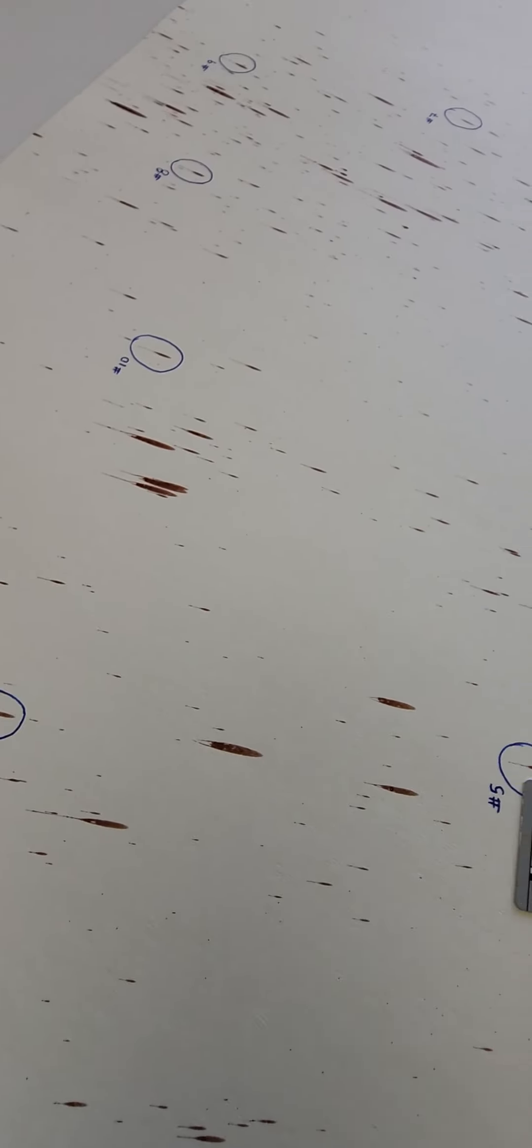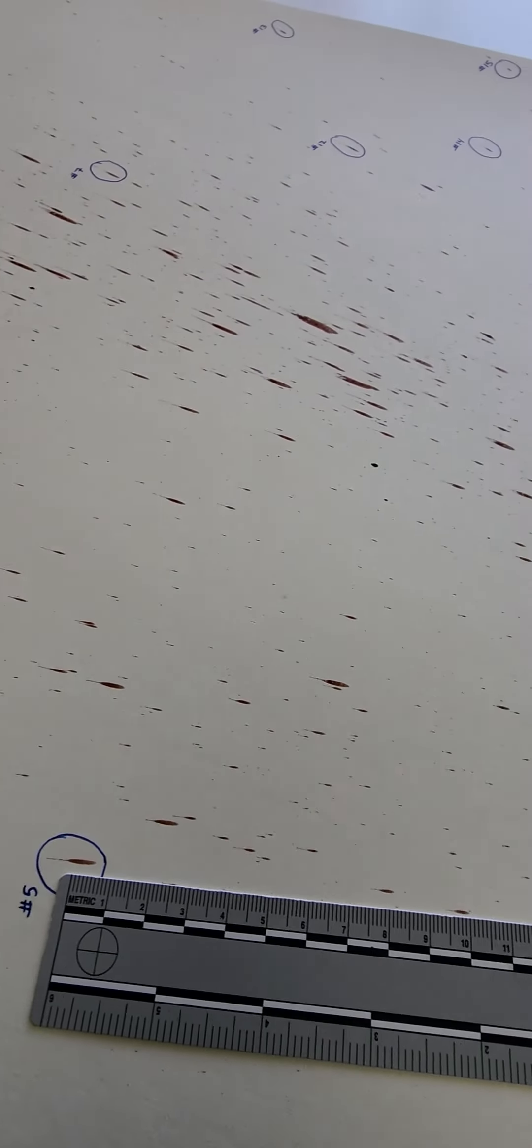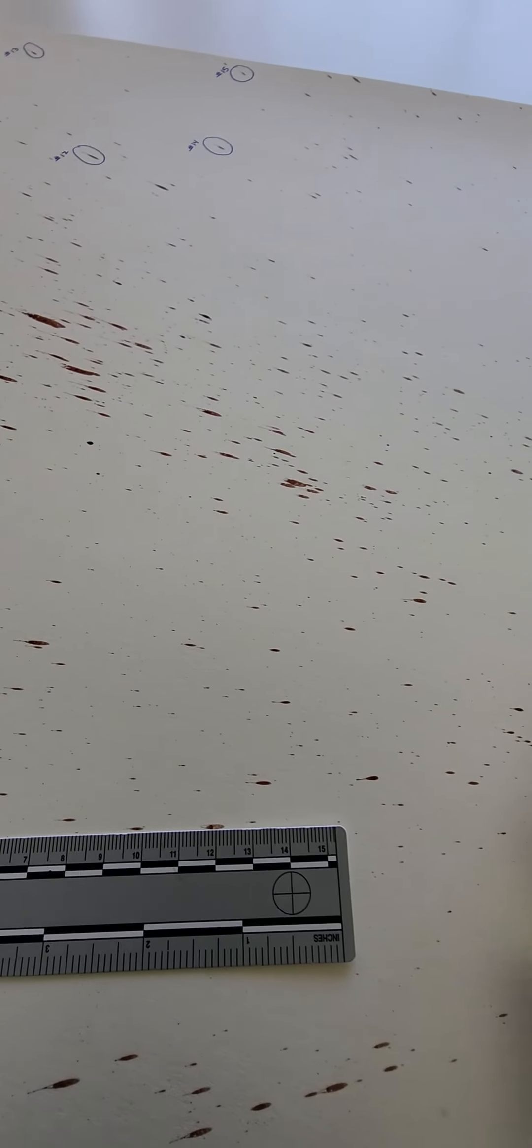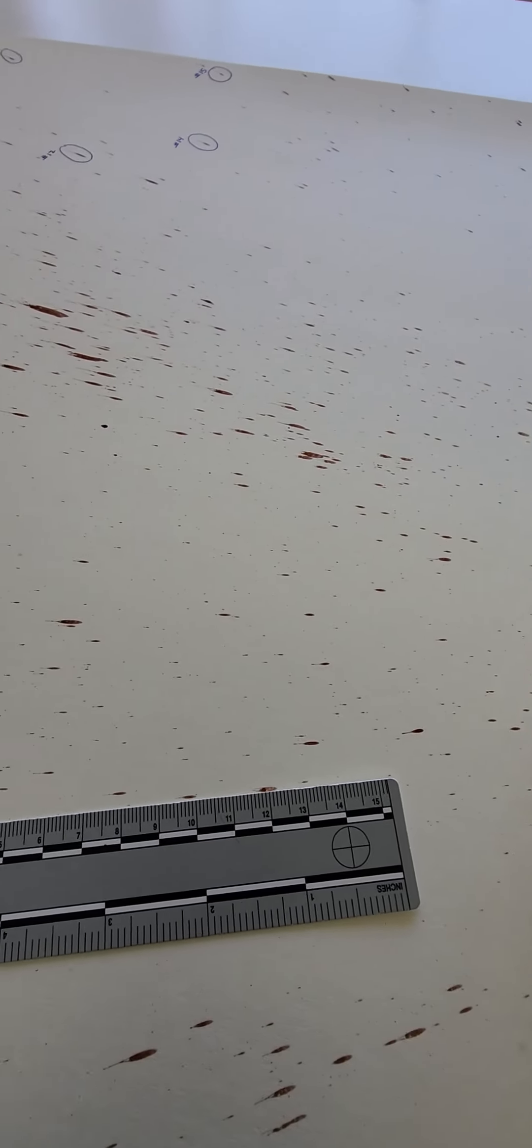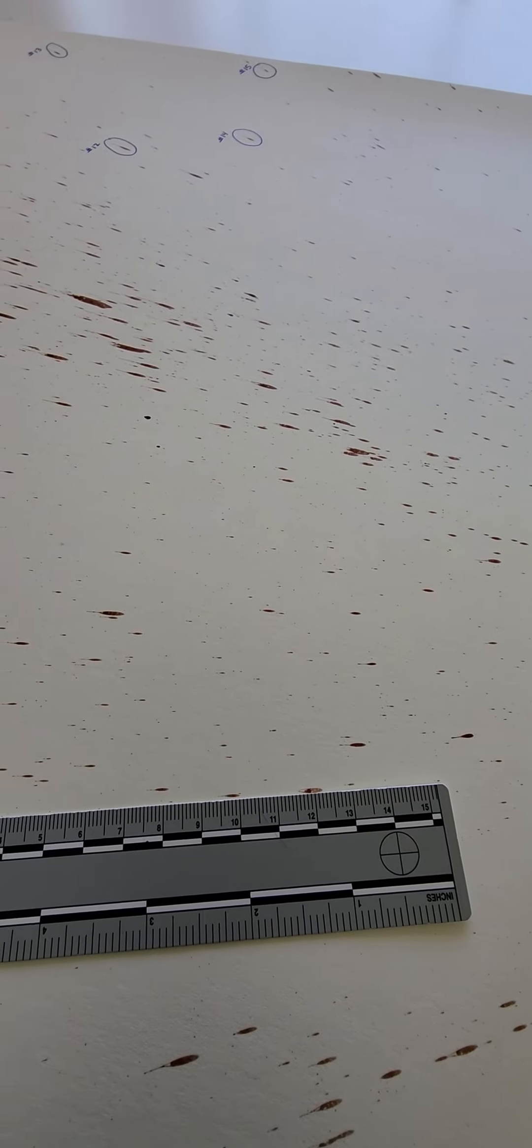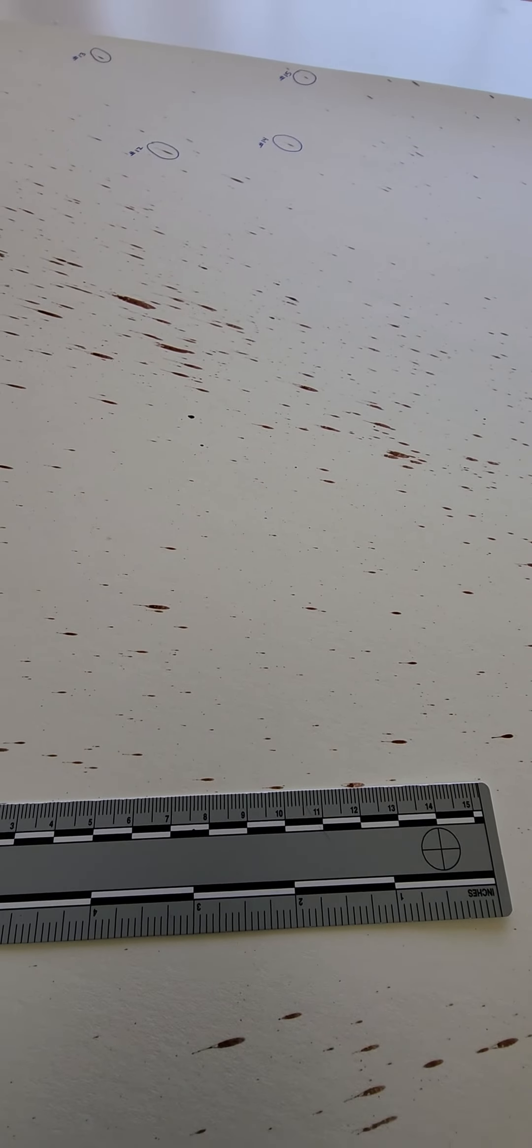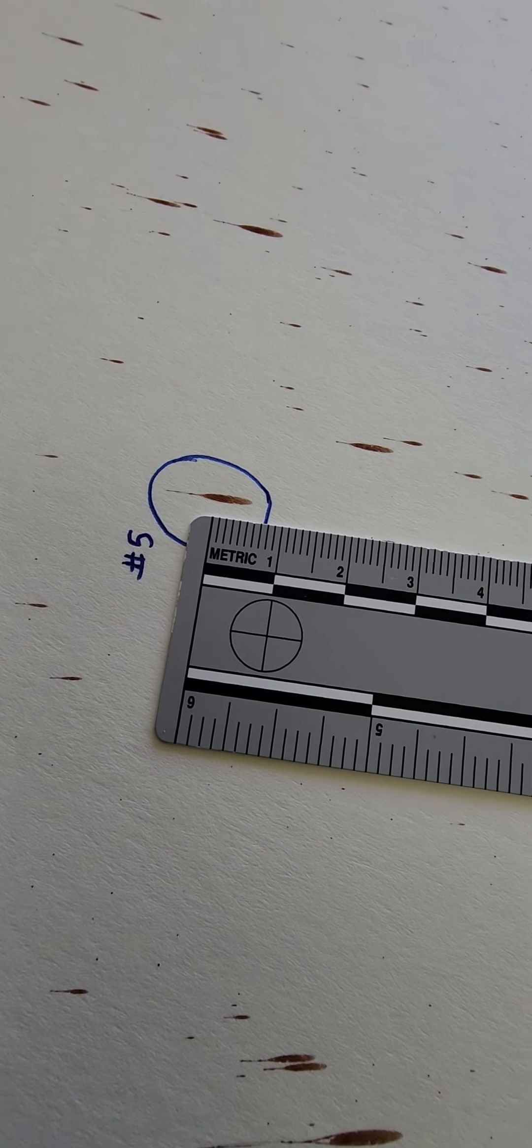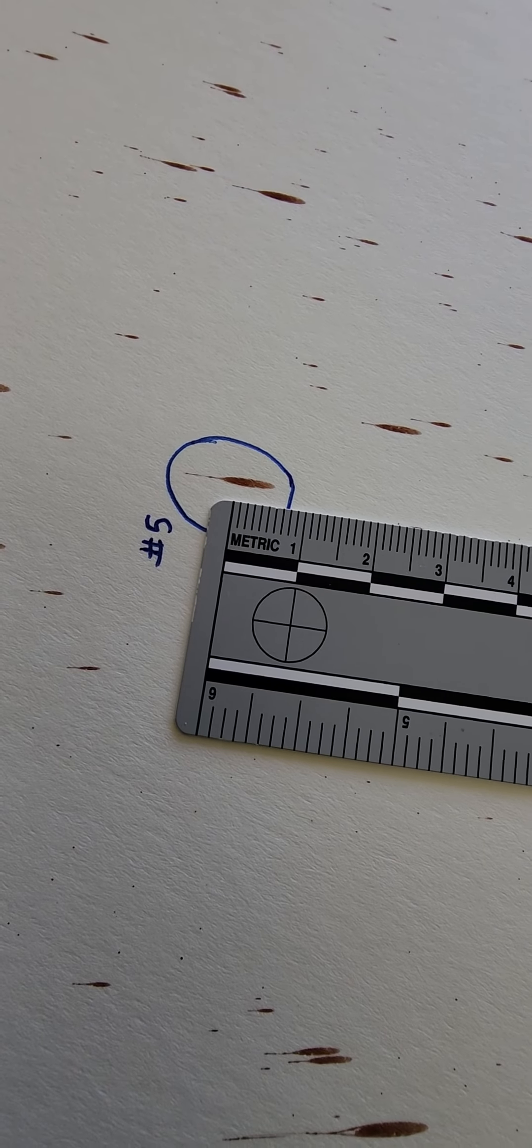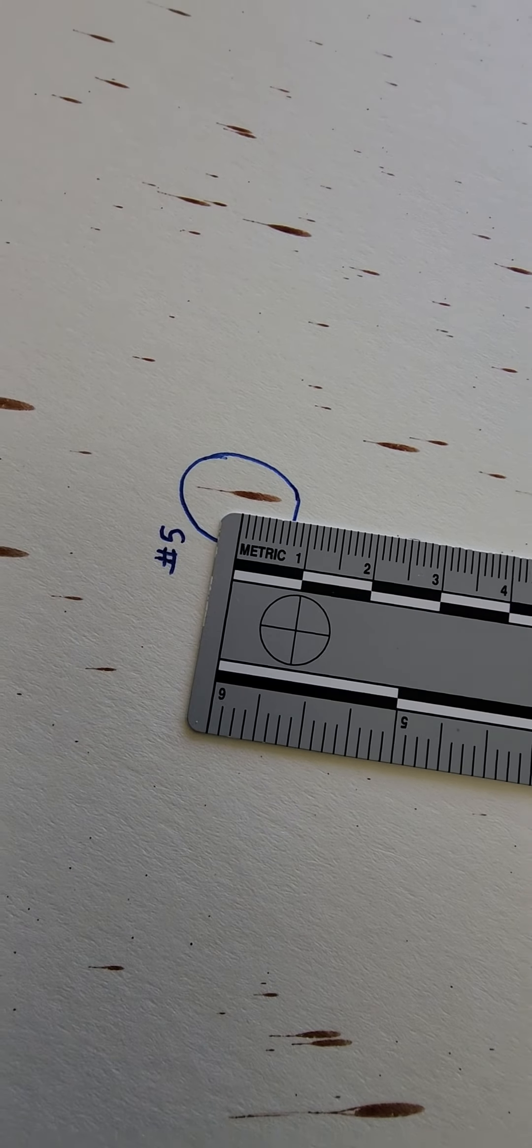And once you calculate them all out, you can do the math and determine the area of origin, which is the point in space where that impact occurred. So as Jeff Gentry, BPA Bloodstain Pattern Analyst, just demonstrating how you correctly measure an impact spatter bloodstain.